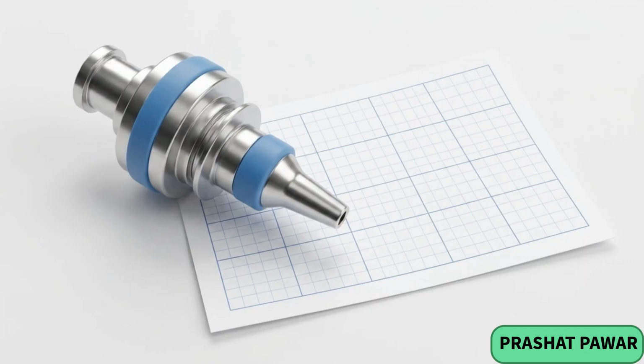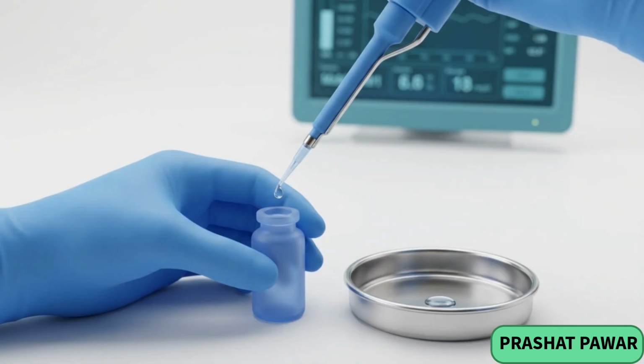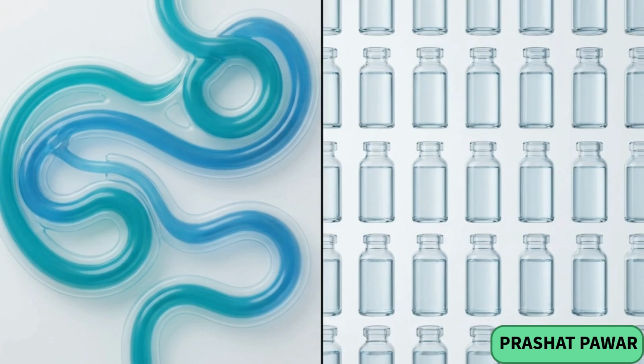The physical dimensions of the nozzles only define the cutoff diameters for each stage. The actual aerodynamic particle size distribution curve is generated off-board. Analysts recover the distinct fractions from the cups and subject them to targeted chemical assays, typically high-performance liquid chromatography. The precision machining inside the NGI serves a single function, transforming abstract fluid dynamics into quantifiable, chemically verifiable physical bins.